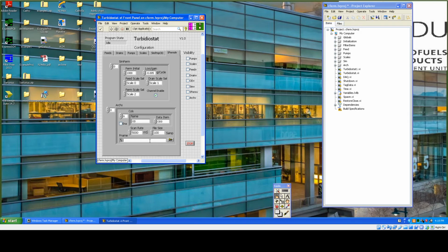This is any file name. We could put in C:/temp/test1. Just like in the ABEC systems, there'll be something appended to this name, so this is a base name. It should include the full path, but the software will append the time of day to spreadsheet files, and XML files will simply get a numeric extension, so it's easier to put them together later.